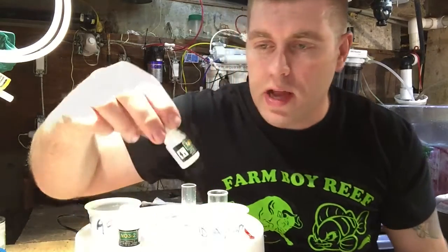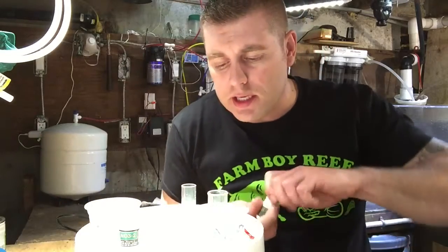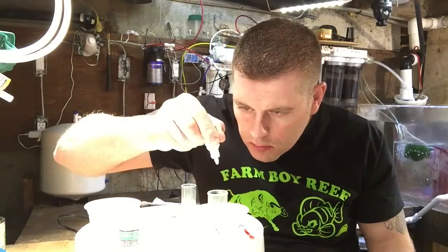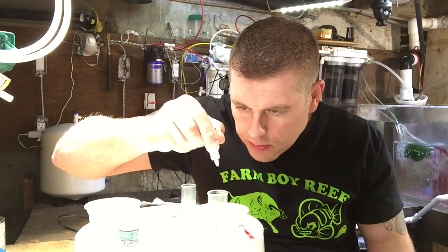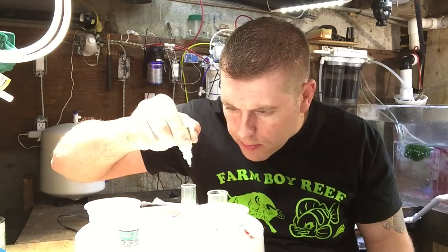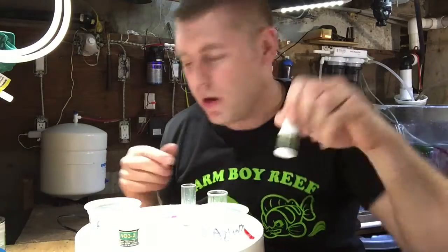Now we're going to add the NO3-1 solution — four drops to each vial. Let's count them out: one, two, three, four. Next one: one, two, three, four. That's the NO3-1 done — put that away.